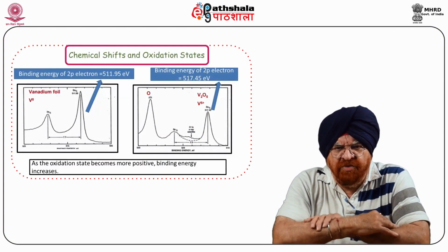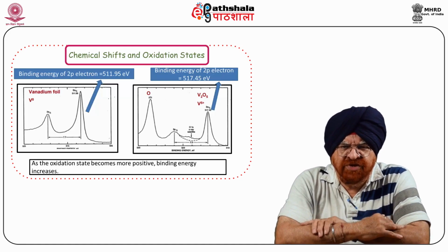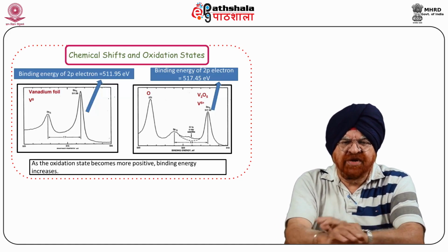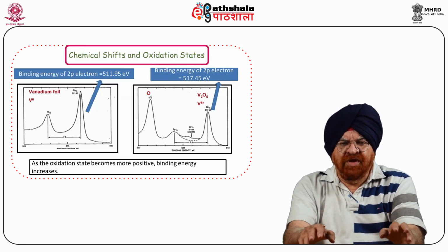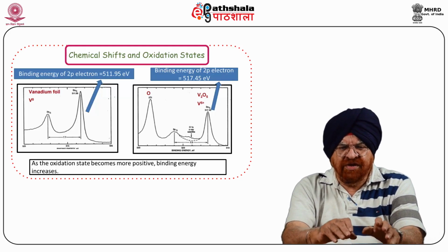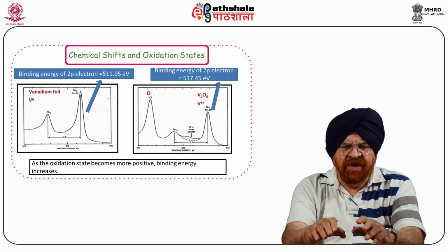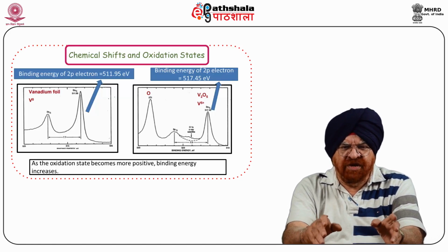By counting the number of photoelectrons and Auger electrons as a function of their energy, a spectrum representing the surface composition is obtained, obviously very accurately. The characteristic spectral peaks obtained correspond to the electron configuration of the electrons within the atom.